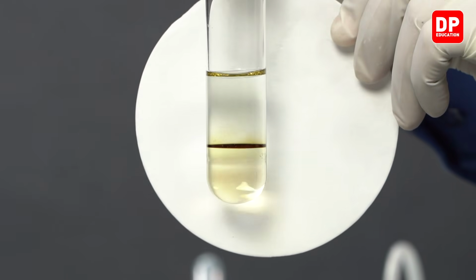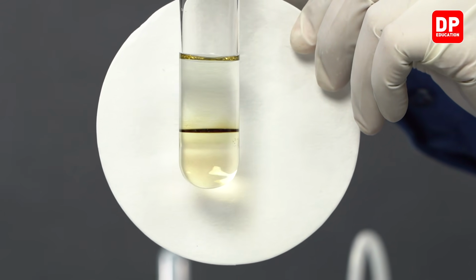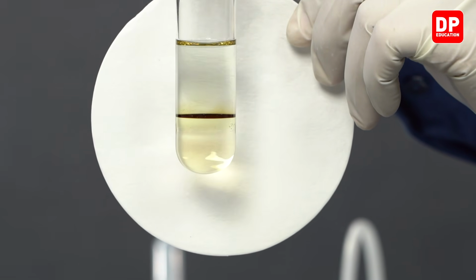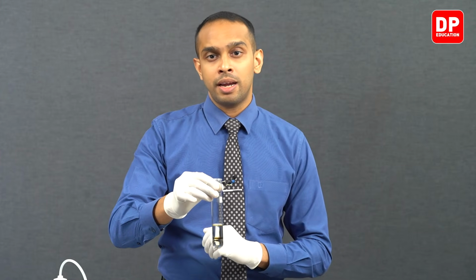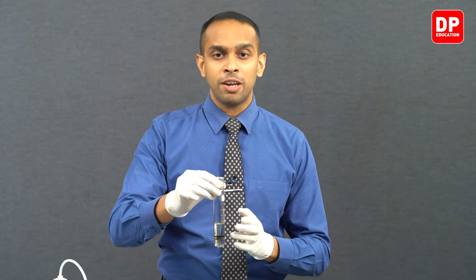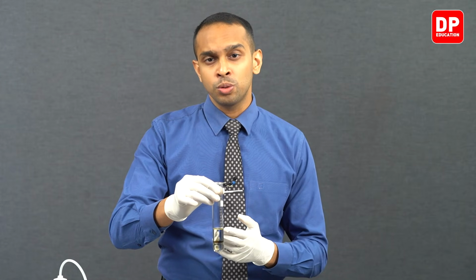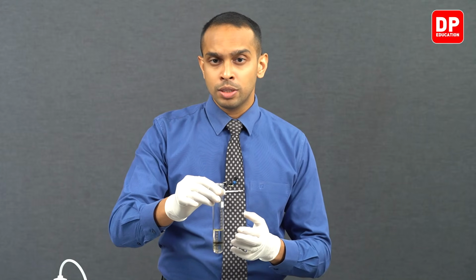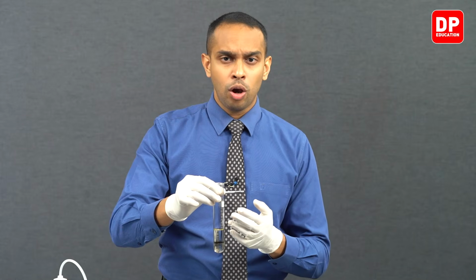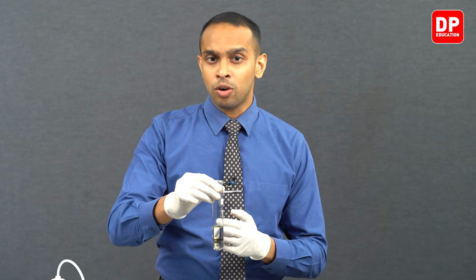So at the interface where these two solutions meet, we can see the formation of a brown color ring. This is due to formation of a complex. Fe2+ ions get oxidized into Fe3+ ions, while the nitrate ions in the aqueous medium on the top layer get reduced to nitric oxide, or in other words NO. So the NO in the medium along with the excess Fe2+ ions will form a complex.